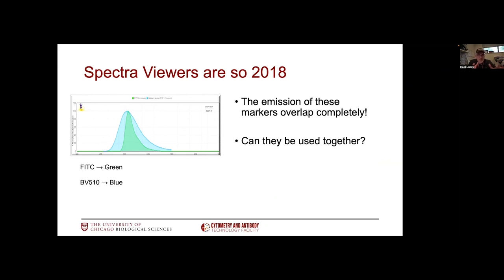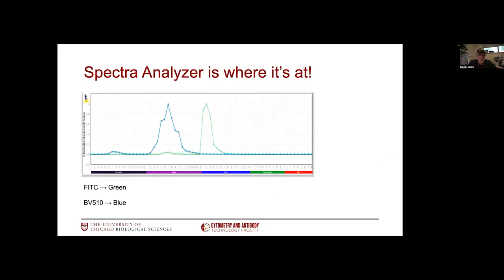I would recommend starting using the spectral analyzer going forward. Spectral analyzers are these tools that were developed in conjunction with spectral flow cytometers. What we're going to see here is the full emission of any given fluorophore as they've been run on a spectral flow cytometer. In most cases, it's going to be the Cytek Aurora. What we have are the different detectors from each of these arrays allocated to each of our laser beams. We have the UV laser detector array, the detector for the violet laser, for the blue laser, yellow, green, and red.